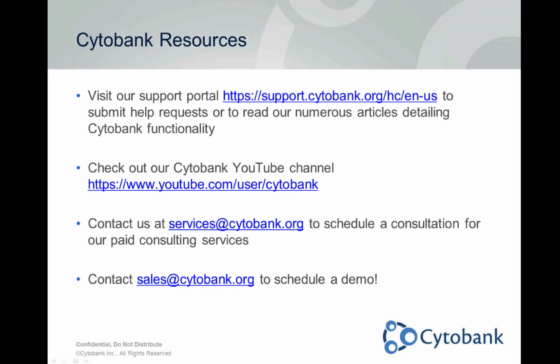So we have a question here. First up, we have several, but first is, what if my outcome isn't a group? Can I use citrus with outcomes like continuous response measurement or survival? That's a great question. That's one that we get a lot. So right now in Cytobank's application, as Jeff went over at the beginning, you have to define your outcomes as groups that you can compare.